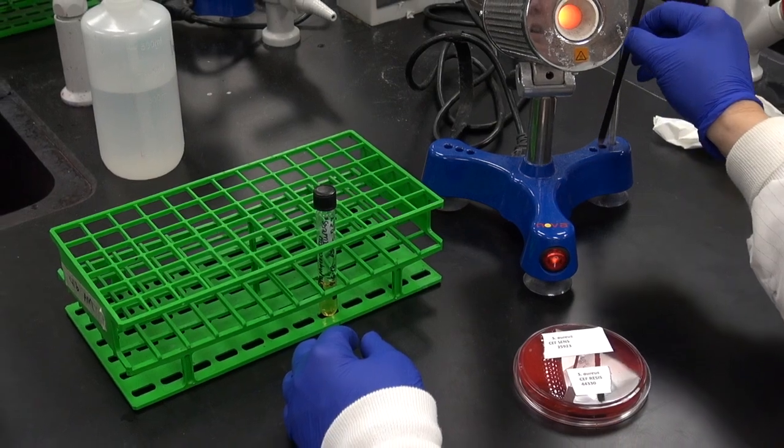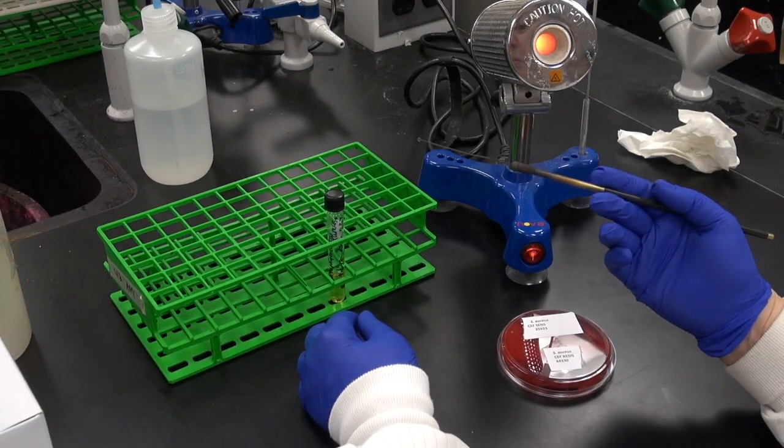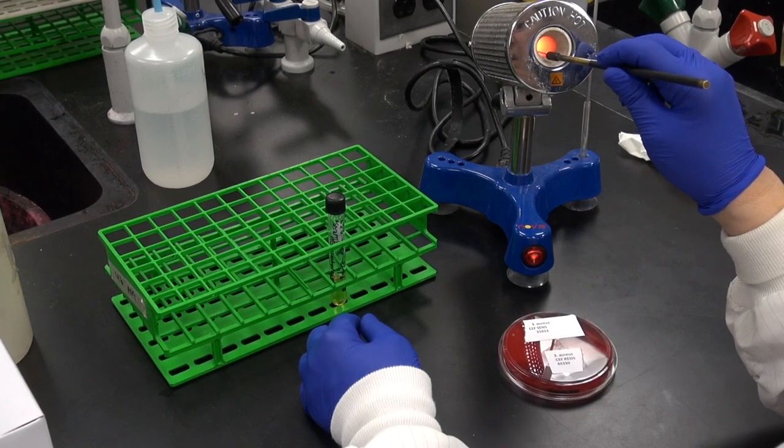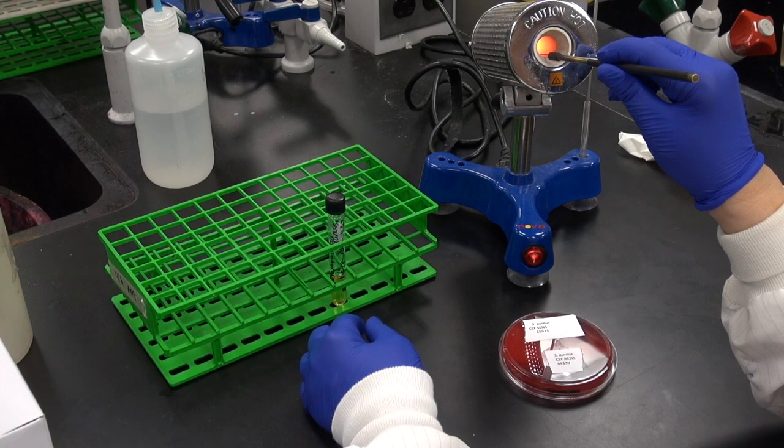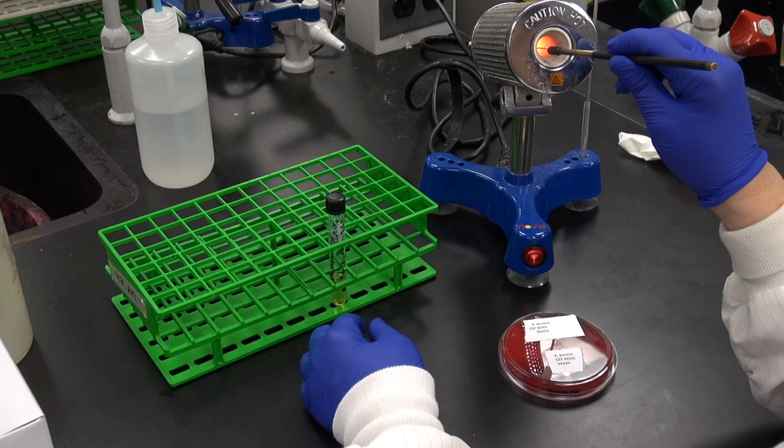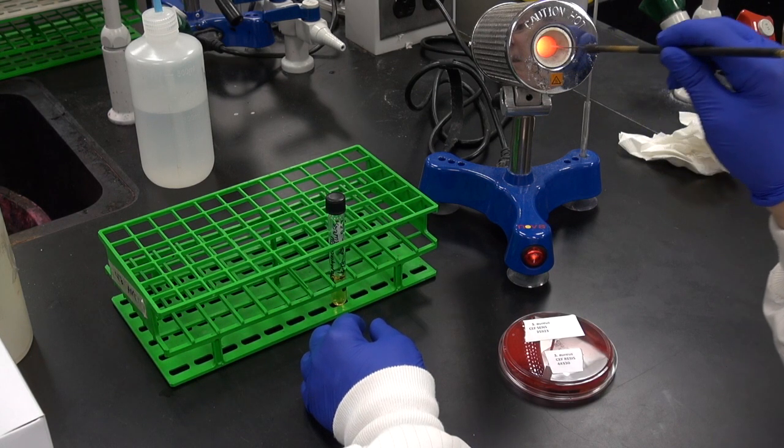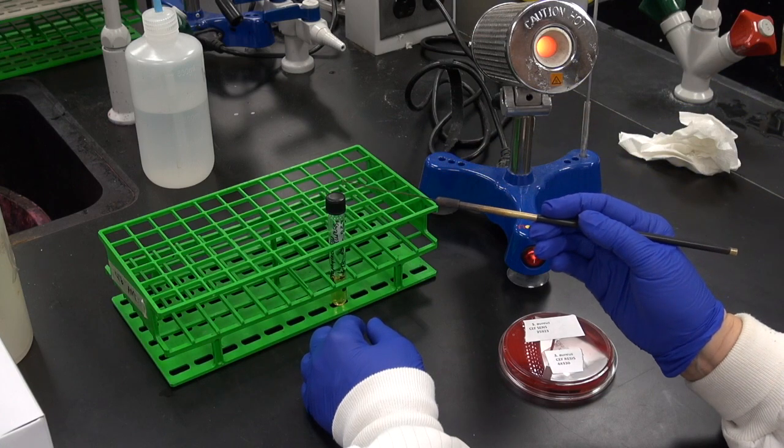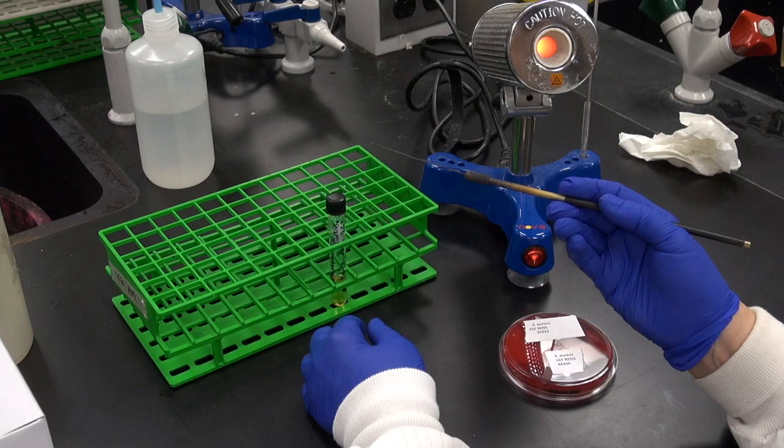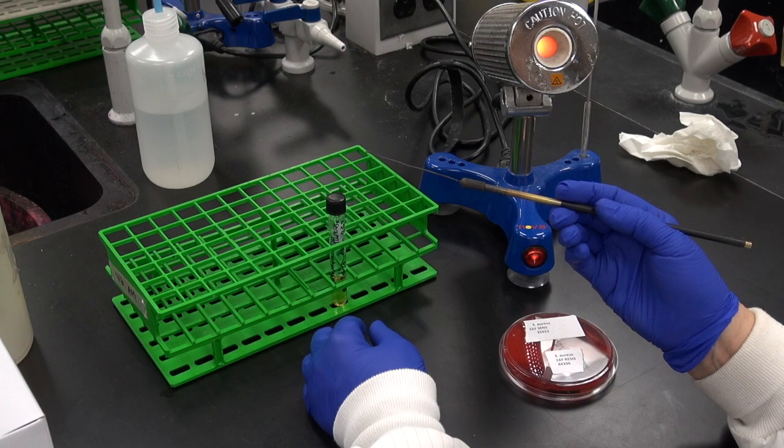We're using a bacteriological loop for this procedure and we start by sterilizing it in the incinerator. Sterilize the length of the wire by heating it until it glows orange. Then remove the loop from the incinerator and allow it to cool so that it doesn't kill on contact the bacteria you're trying to transfer.